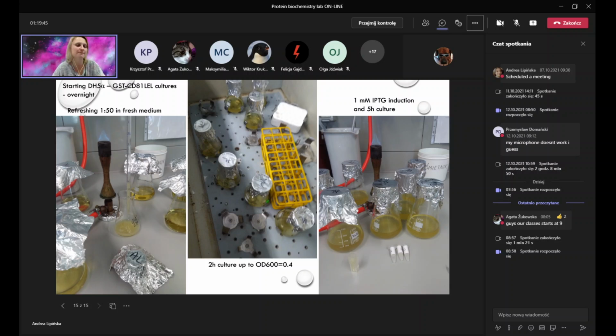and the bacteria are rotated at 200 rounds per minute usually. So like 200 RPM, this is quite fast. We shake them because E. coli is not an anaerobic bacteria. It requires some oxygen, so we have to provide oxygen at least by mixing.